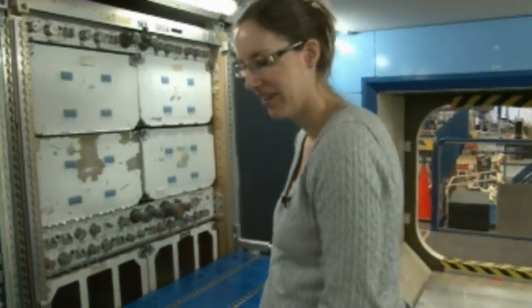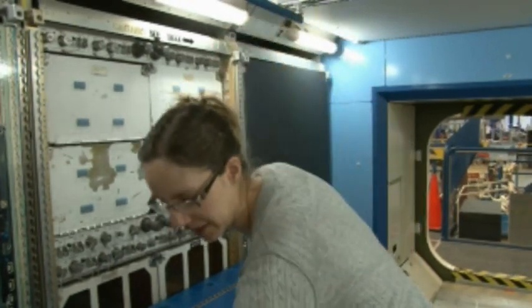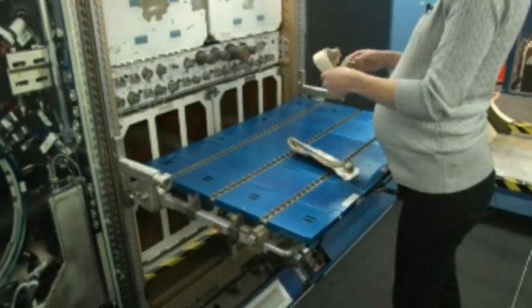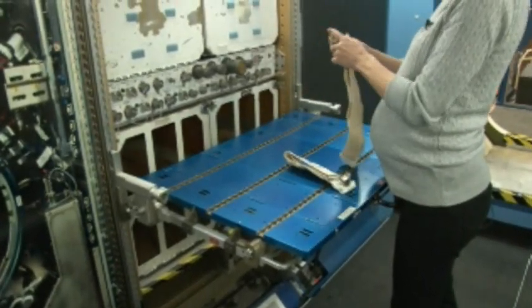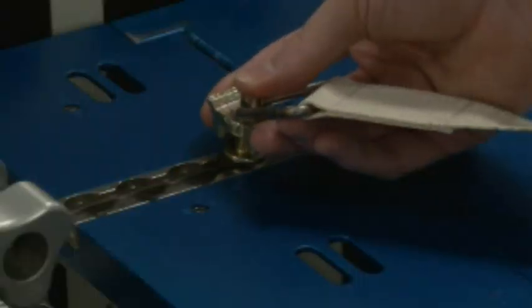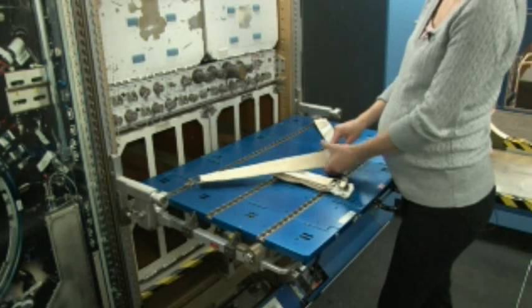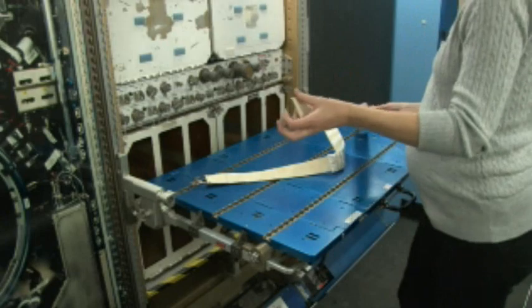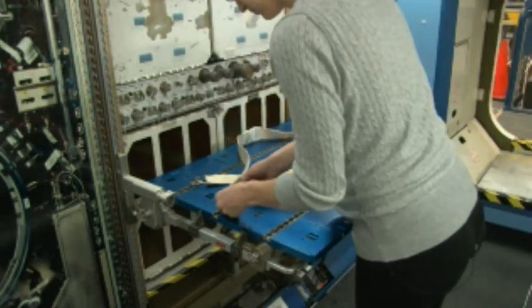First, grab the two seat track straps from the wet lab kit to deploy on the MWA. Take one strap and attach it to the back row of the MWA. It will loop around, but that's fine once you put the glove bag frame in it. Take the second strap and attach it to the middle row of the MWA.